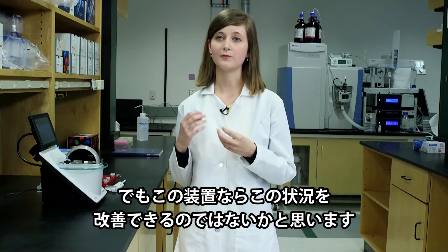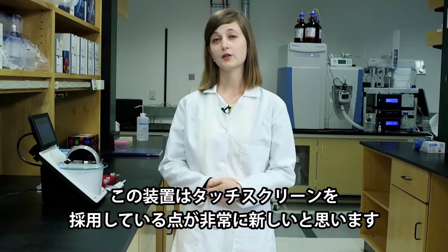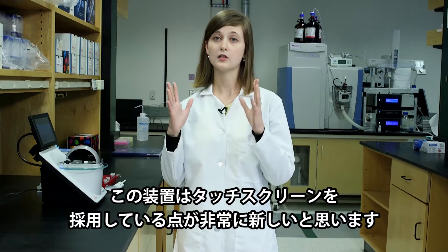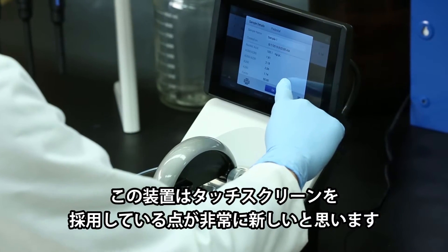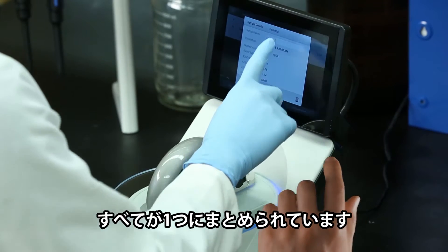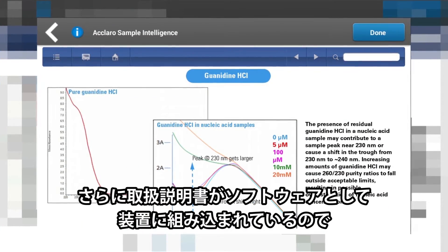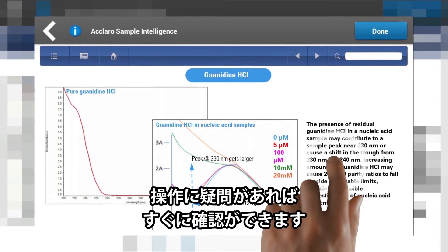With this instrument, I feel like it makes the process a lot easier. I think it's really novel that the machine has a touch pad integrated into the machine. It makes it so there's no bulky computer and desktop. Everything's in one place, and if you have questions, even the manuals are integrated into that software on the machine.